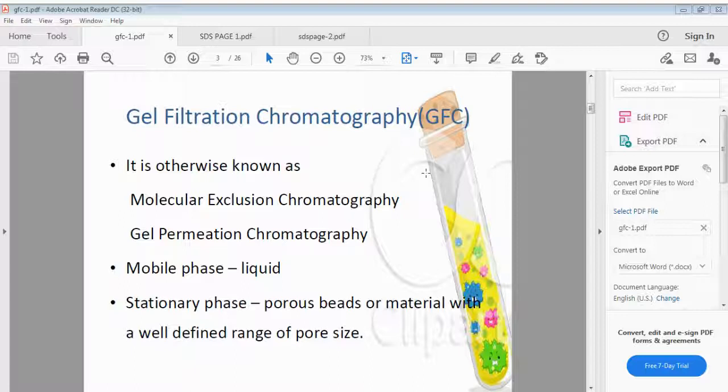They will remain in the mobile phase present in the column, in between the gels. You can imagine the gels as small particles, say 10 particles or 100 particles. I always told you there are pores. Pores here means the intermolecular spaces in the stationary phase. So the intermolecular spaces or the pores of the column bed, as you call it, can either be small in size or bigger in size.